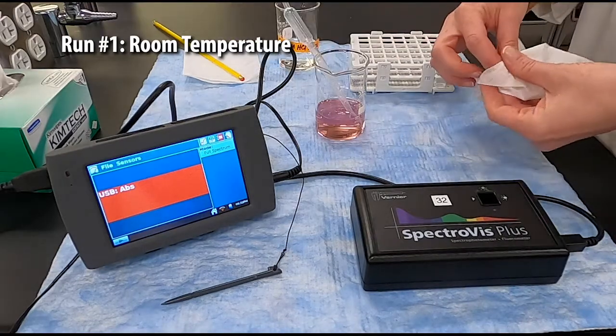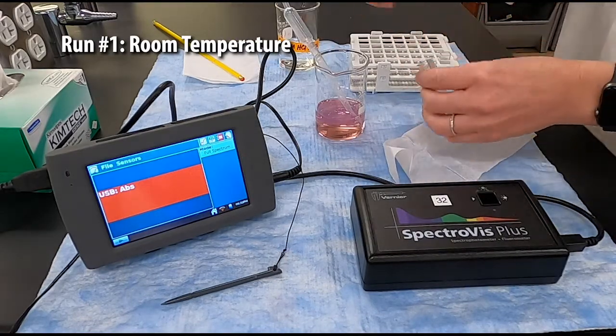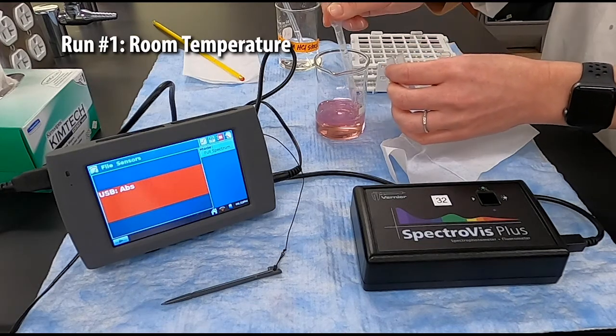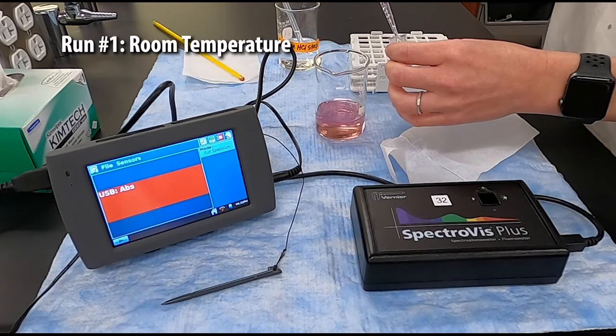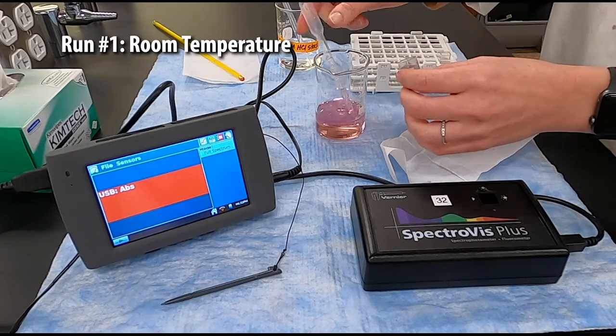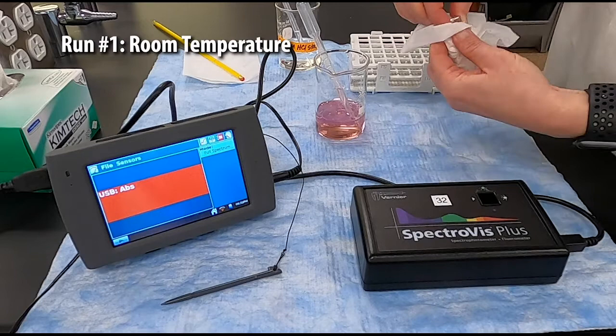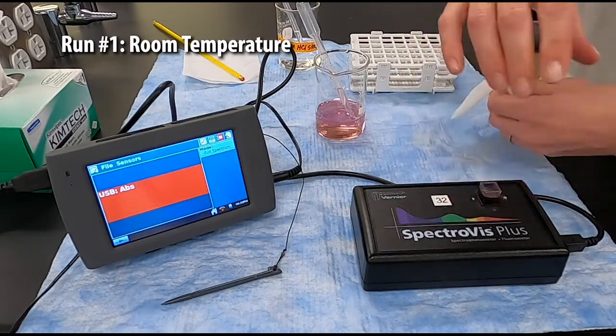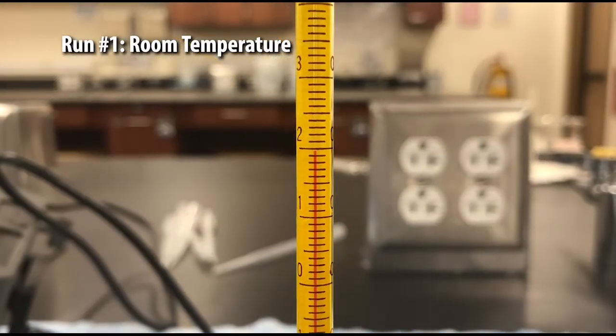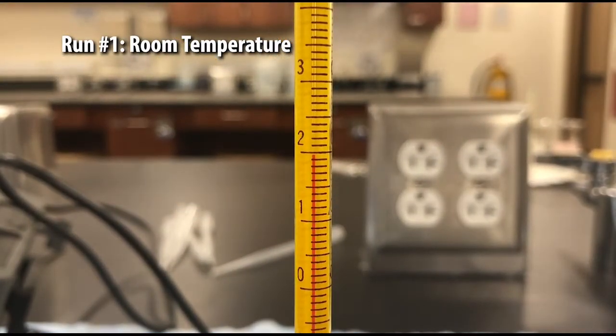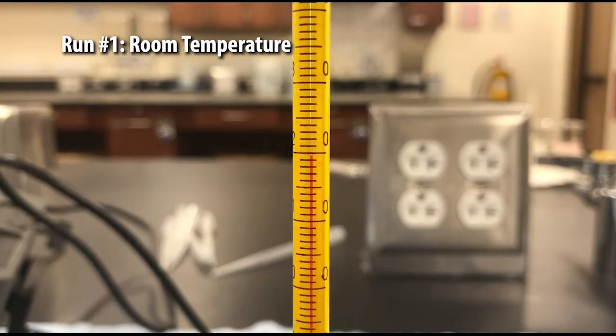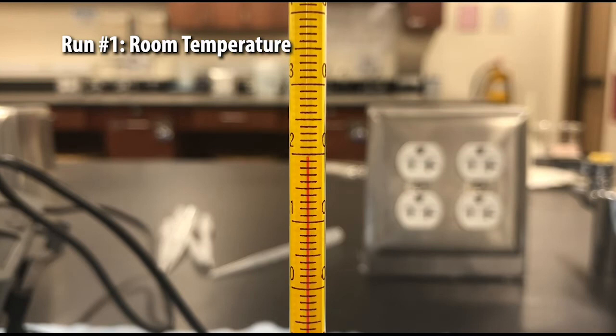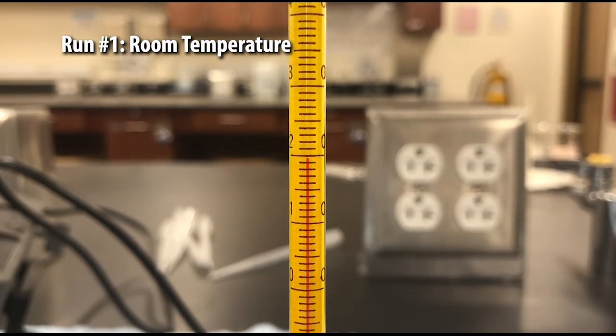The first solution we're going to take the spectrum of is our room temperature solution because that's the easiest. Fill a cuvette about three-quarters of the way full with our solution that we prepared. For each run, you're going to want to measure the temperature. This thermometer is showing us what the temperature is of our room temperature solution. Be sure you take note of what each mark is worth on this thermometer and how many decimal places you're going to record.